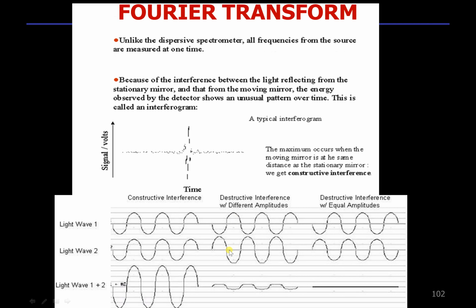So this is really destructive, and finally you get a smaller signal. Destructive interference is with respect to equal amplitudes. If the troughs and crests are of equal amplitudes, then you will get a flat line. So here you get somewhere flat lines, and somewhere these are the constructive interferences, these are the destructive ones.